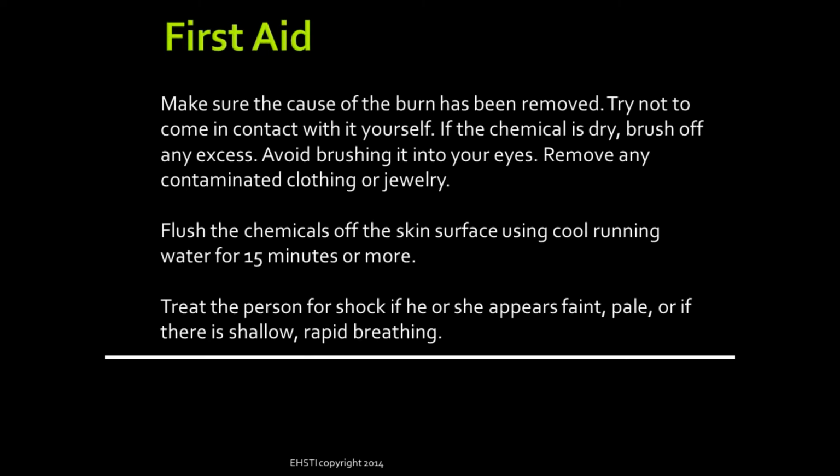First aid. Make sure the cause of the burn has been removed. Try not to come in contact with it yourself. If the chemical is dry, brush off any excess. Avoid brushing it into your eyes. Remove any contaminated clothing or jewelry. Flush the chemicals off the skin surface using cool running water for 15 or more minutes.